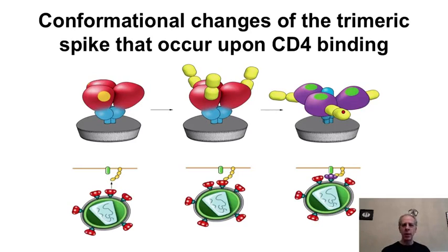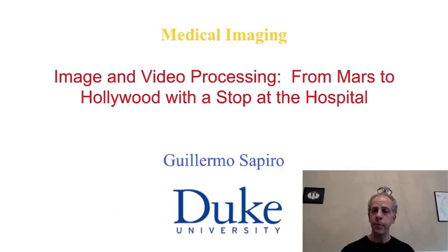When we talk, for example, about activity classification, that was to do in the computer something that the human knows how to do. Here is to do something that the human cannot do. We cannot see the 3D shape just from those projections or from those tomography 3D reconstructions. We need to do this image processing. I hope you had fun. This is an exciting area, and this is just the tip of the iceberg of research in image processing and viruses and microscopy. But it's an illustrative example about the power of image processing to solve real problems.